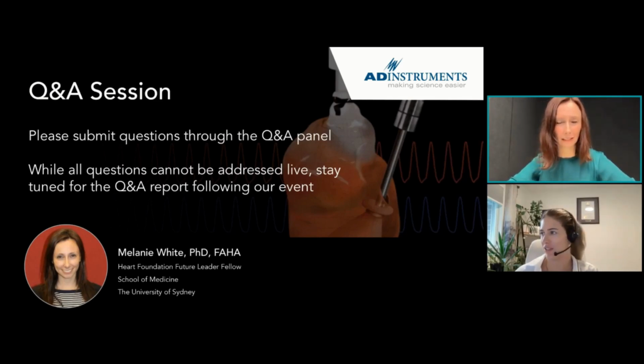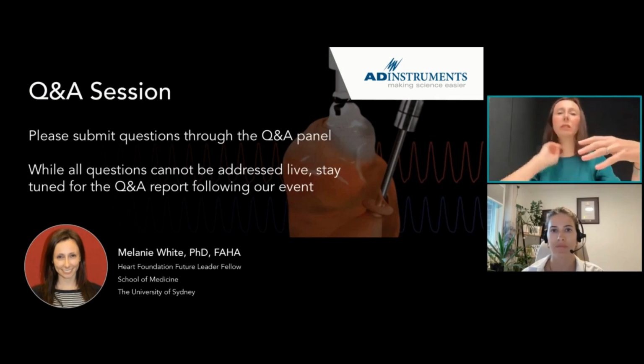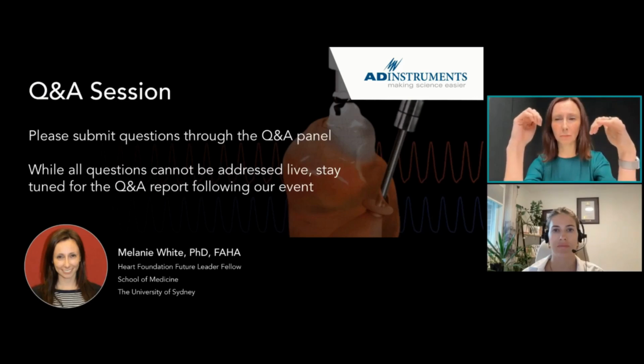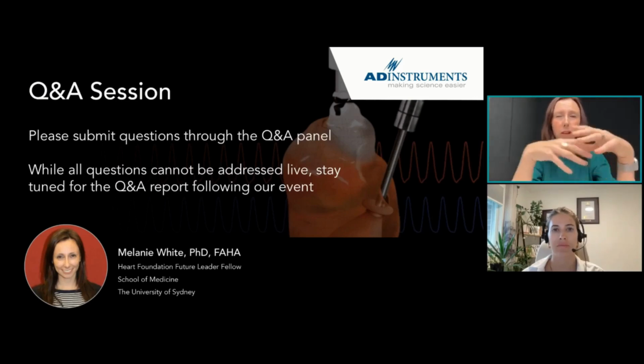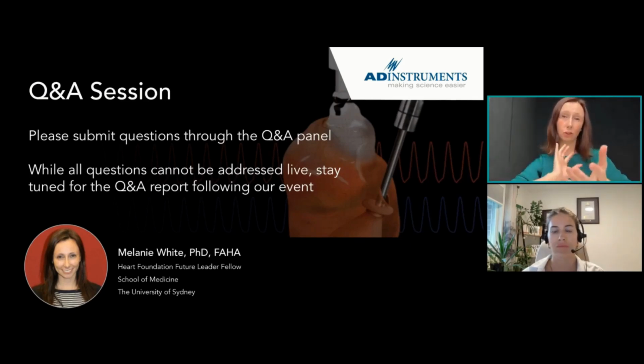Okay, fantastic. Thank you for that honesty and information. Do you have any tips for immobilizing the heart during recordings? For example, monophasic APs. Yeah, look, the new system that we got from AD Instruments has a specially designed cap which has these 4 ports beyond the 4 ports into the direct perfusion core, which allows us to securely insert the electrode set that you can also purchase. And because there are those 4 reference points, it also allows us to secure the heart and immobilize it. So I'm really hoping that that is one of the ways that we're going to be able to immobilize the heart really nicely.